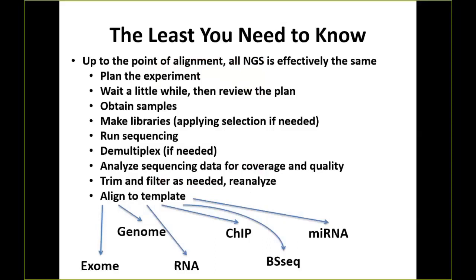The next step is obtain samples. Obviously, sequencing comes from somewhere, so you've got to obtain your samples. Be very careful about how you obtain and handle your samples. Just as an example, I deal a lot with microbiome, especially intestinal microbiome, which is gotten from stool samples.